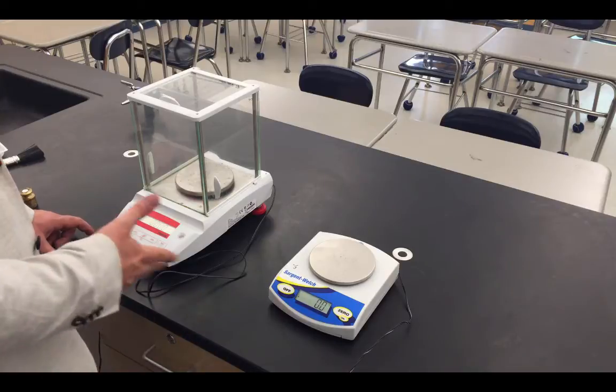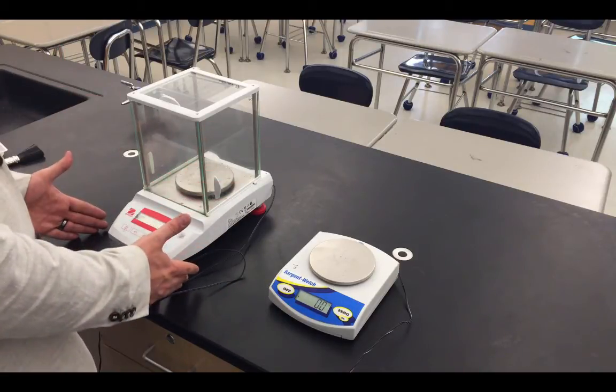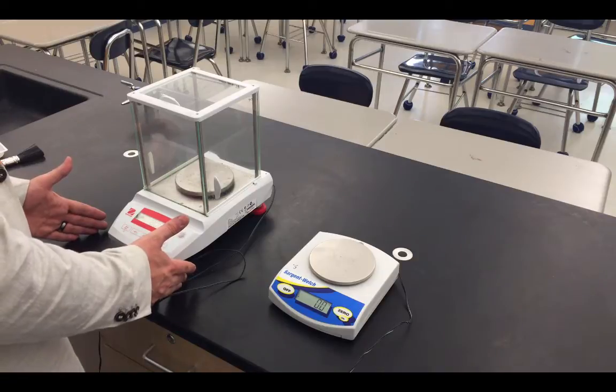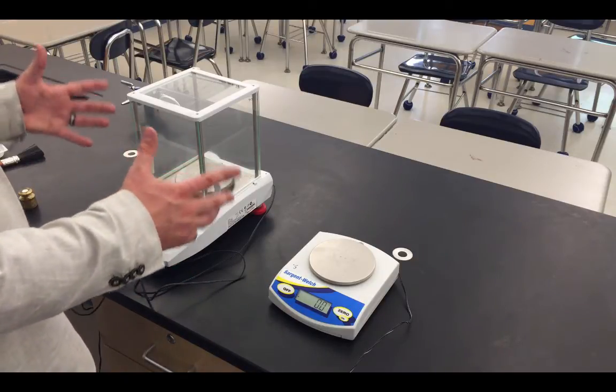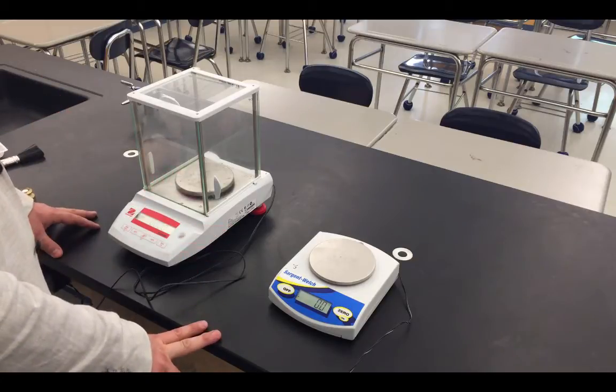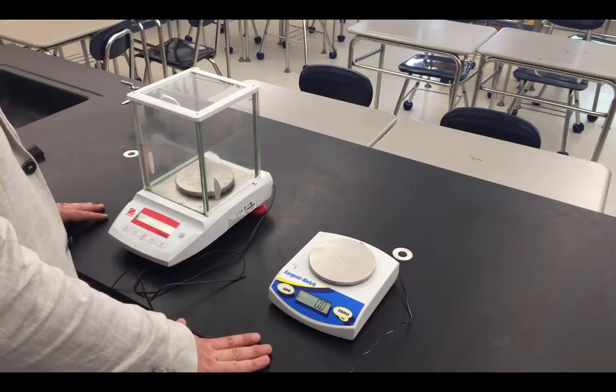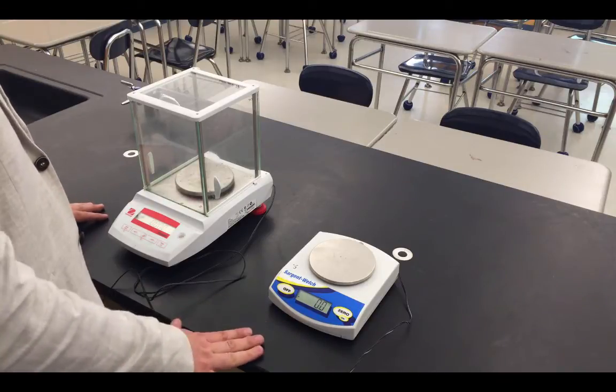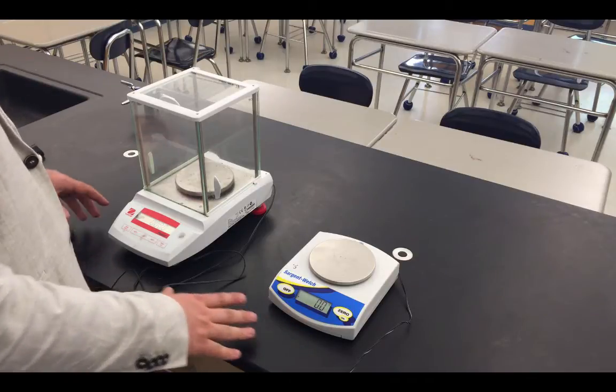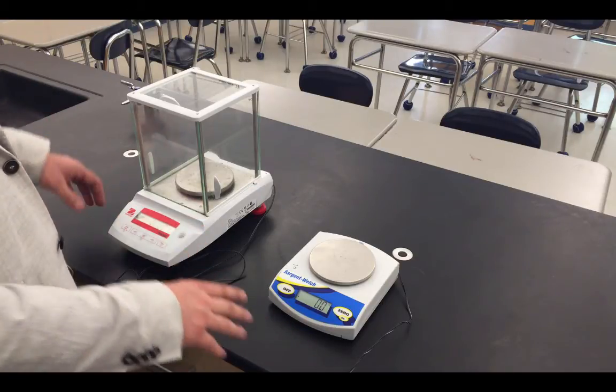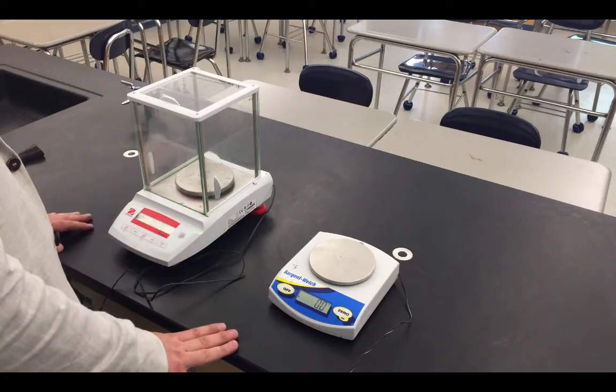Last but not least, we do actually have a couple different types of balances that we use here at the high school. This balance is known as an analytical balance. It reads a large number of decimal places, in this case this one reads three decimal places, which gives our measurements a very large number of significant digits. This balance here, conversely, is known as a pan balance. It's a simple device and as a result it reads fewer significant digits. This device only reads one decimal place in grams, usually leading us to answers in the two to three to four significant digit range, as opposed to the five or six significant digits we expect to get with a device like this.